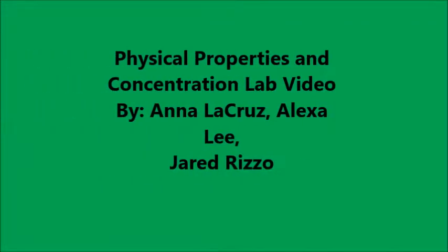This is our video for the lab physical properties and concentration, but before we get into the experiment, there's some background information we need to go over.